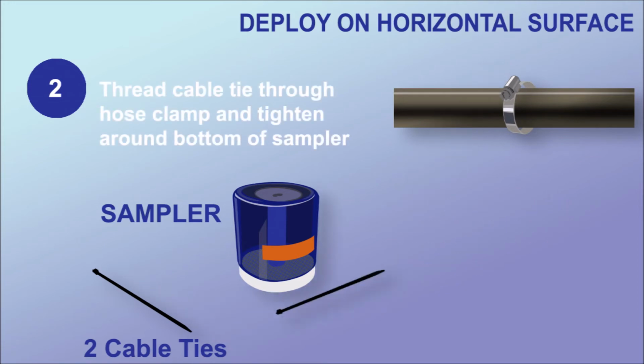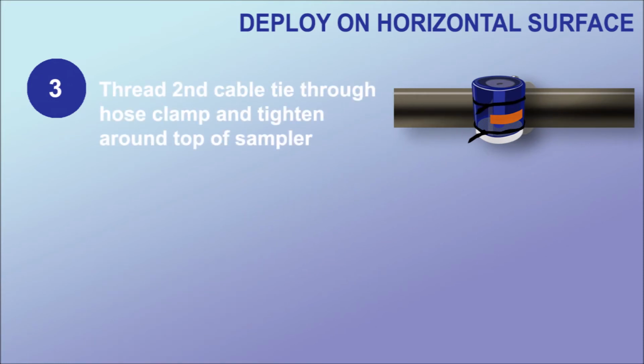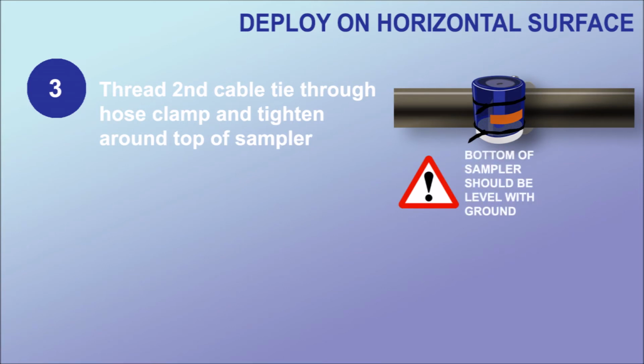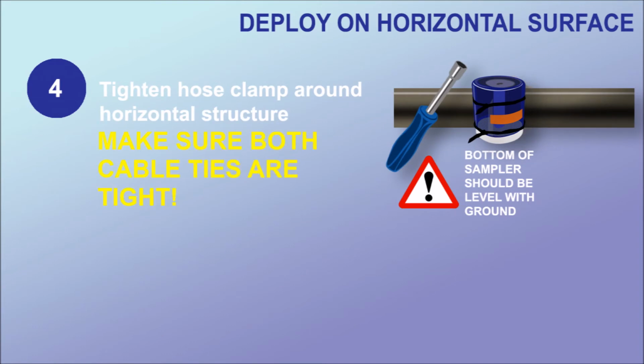Next, thread a cable tie through the hose clamp and tighten around the bottom of the sampler. Thread the second cable tie through the hose clamp and tighten around the top of the sampler. The bottom of the sampler should be level with the ground. Finally, tighten the hose clamp around the horizontal structure. Make sure both cable ties are tight so the sampler does not move under strong winds. Take note of the date and time.